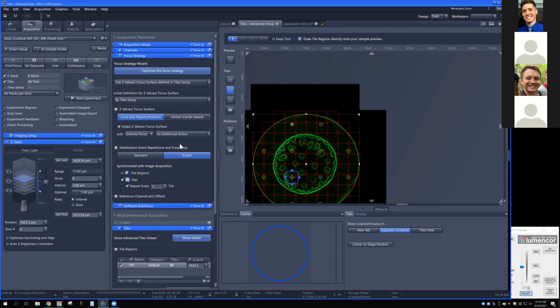These kinds of settings, let's talk about when they are useful. Let's back up and do one by one, and then I'll talk about this more combination type thing. Something like Z values from the positions hopefully is obvious when you'd want to use it. It's when we're doing these kinds of tiles that we've just been working on for the last 45 minutes, or doing multi-positions and you just want to set it up and go.